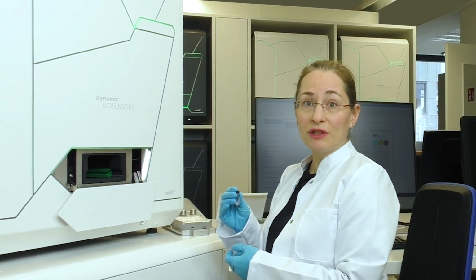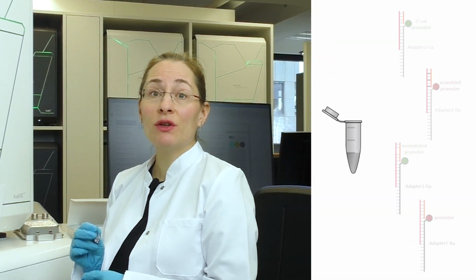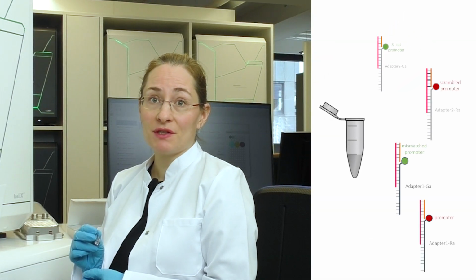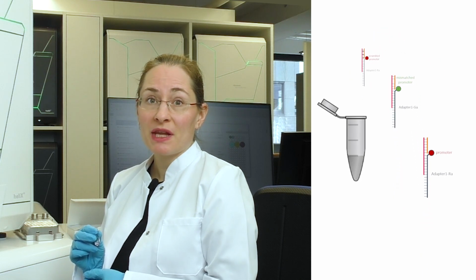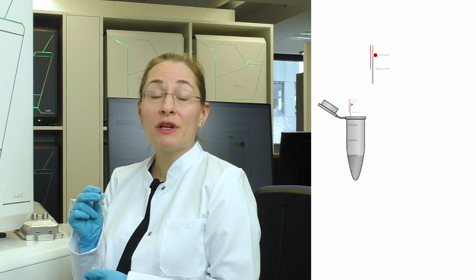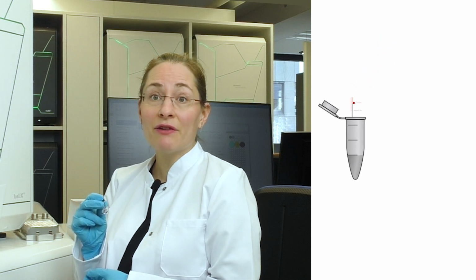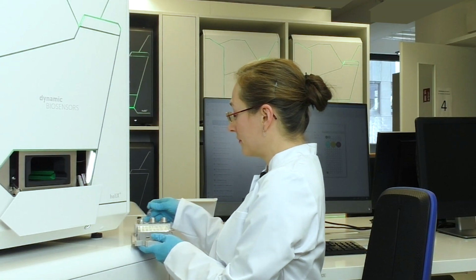The small vial contains all 4 target DNA oligos. The 4 different ligands have been pre-incubated individually with their respective adapter strands to ensure the specificity of the spatial color code. In the kit, I received the ready-made mix of all 4 in one vial, ready for the multiplex functionalization. I can directly transfer the provided vial into the autosampler.